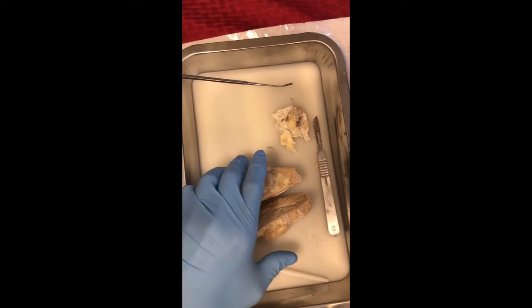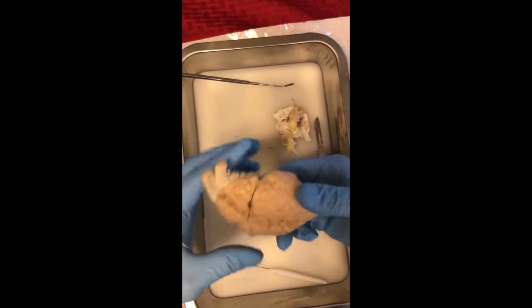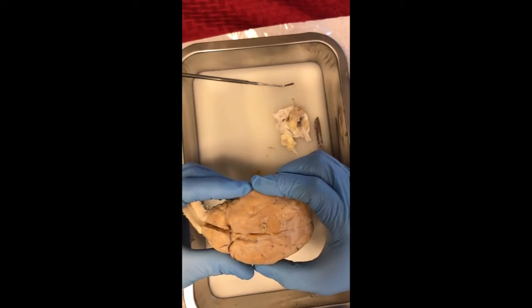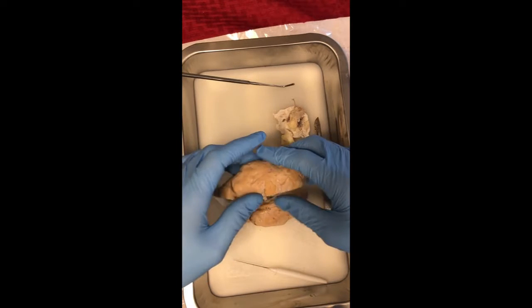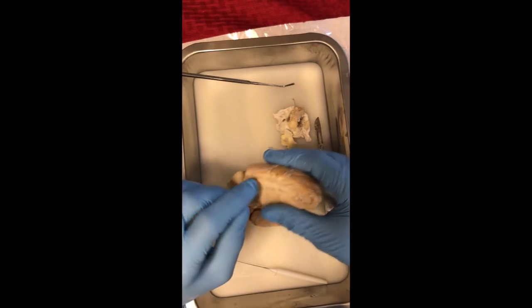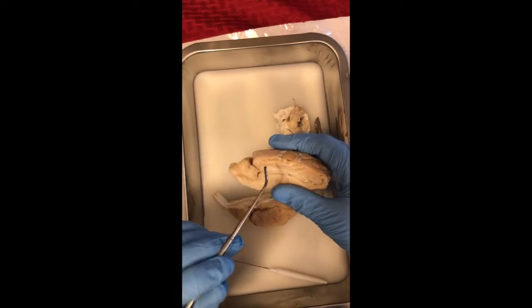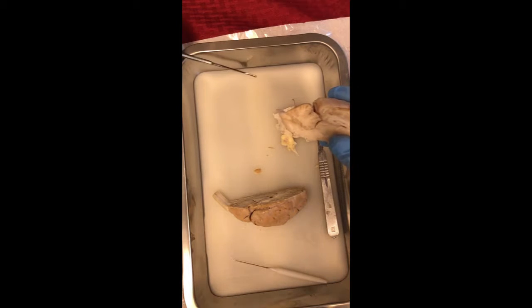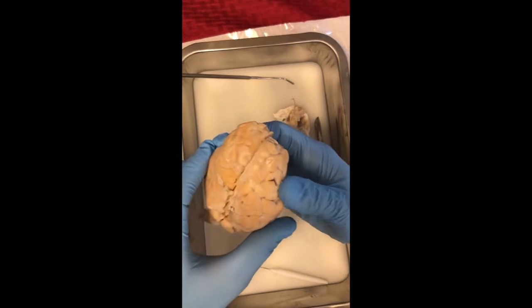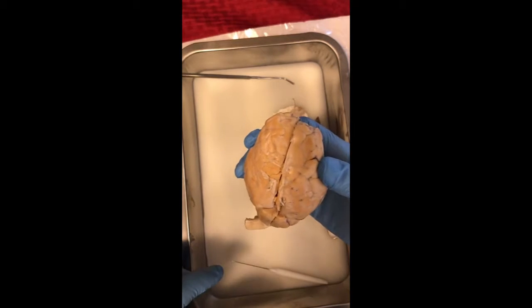Okay, so our cerebrum, this is the brain in its entirety. The cerebellum is the smaller part, so the cerebrum is comprised of this area here. You have the sulcus and the gyrus. Gyrus would be the outermost parts of the fold, and the sulcus, those are the smaller openings that go down. And then the longitudinal cerebral fissure, if we look at the brain like this, we see that it goes all the way down and separates the left and right sides.